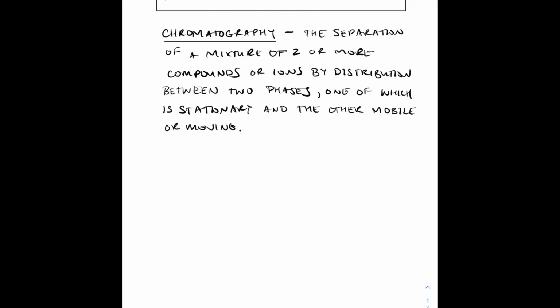I do want to remind you that TLC is a solid-liquid phase type of chromatography, and this is what we're doing.